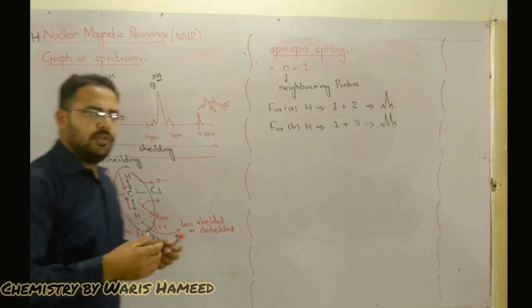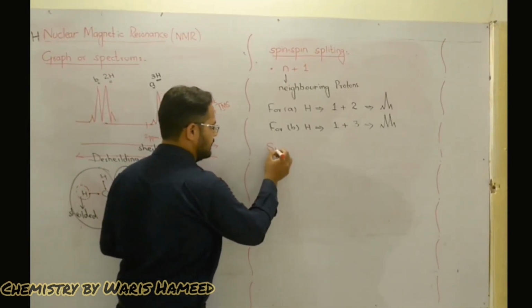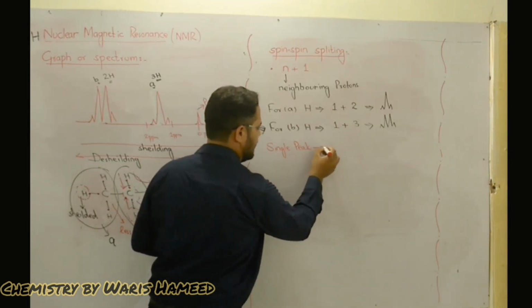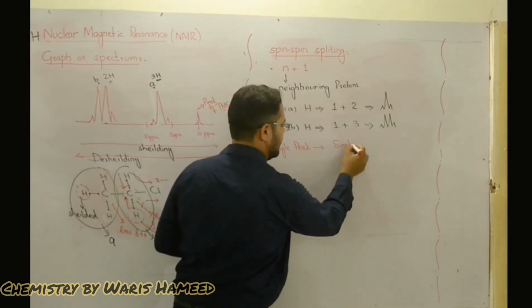Now, if we receive a single peak, then it's a singlet.